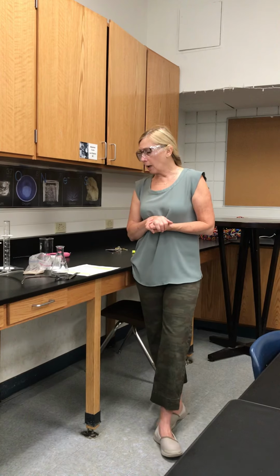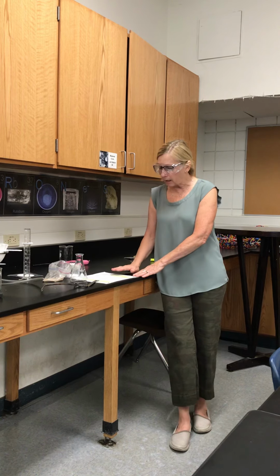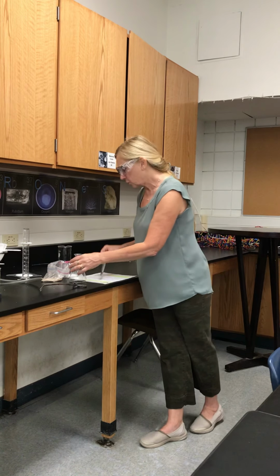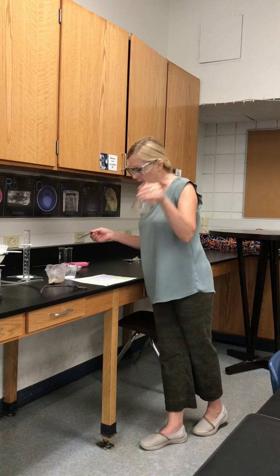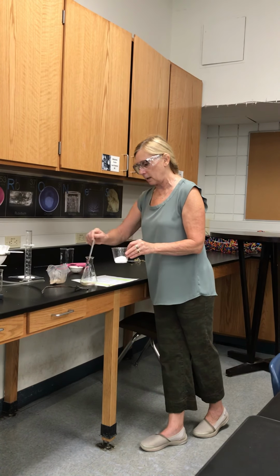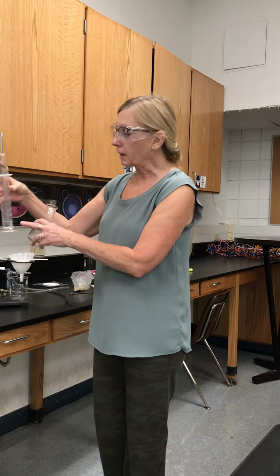So the first change we're going to observe will just be, well, you tell me. We're going to go and we're going to talk about it as we go along. So I'm looking down on my lab sheet, and procedure 1 is mixing sand, salt, and water. So the directions tell me to place a small scoop of sand. So I'm going to take the sand and I'm going to pour it into my Erlenmeyer flask, and also a small scoop of salt, and I'm going to place that in the Erlenmeyer flask. Next it says to add 10 milliliters of water, and I have measured these out.